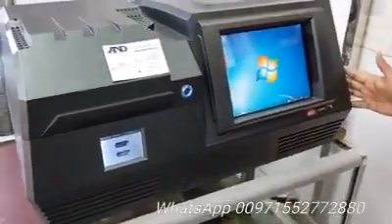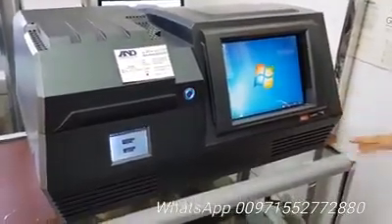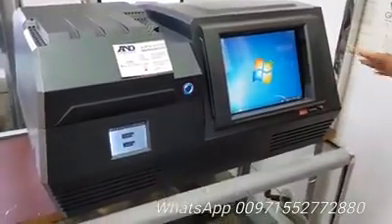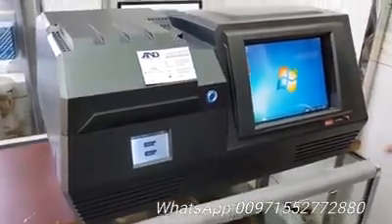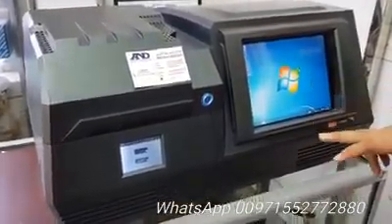Today we are giving a review on an X-Ray machine. It's called an X-Ray XRF or Metal Detector. Basically this machine functions for gold testing.